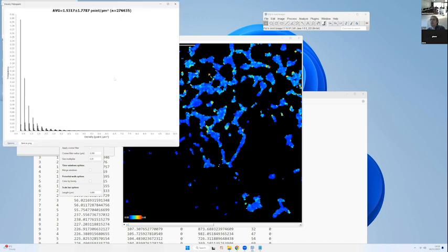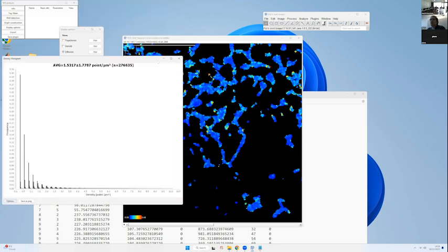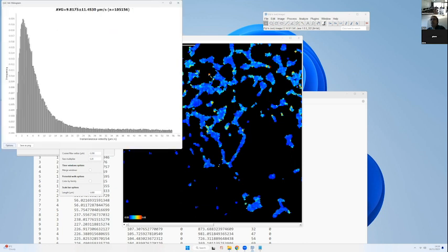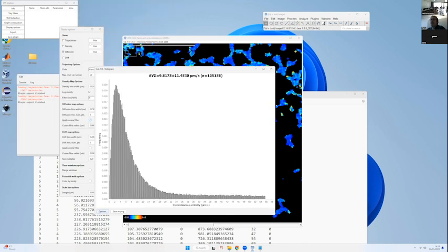You can do that with the density, though it's not super useful. And you can do that with the trajectories. When you do it on the trajectories, it shows you the histogram of the instantaneous velocity. So basically, it's just the displacement length, how much you move between two successive points divided by your acquisition time.